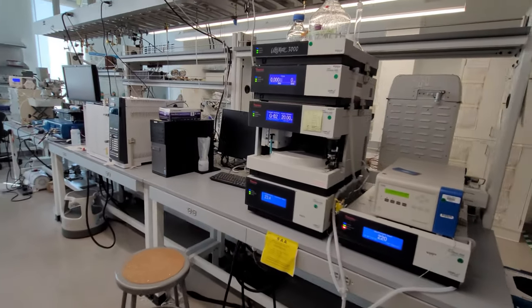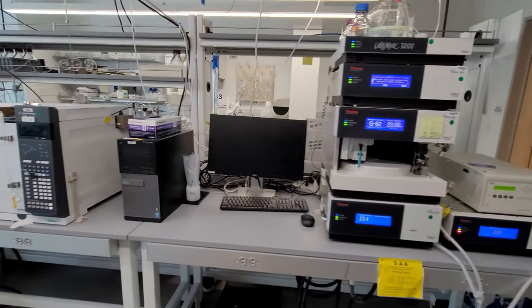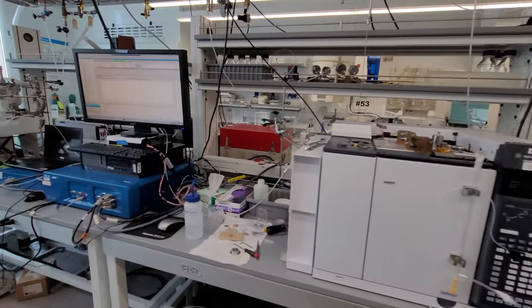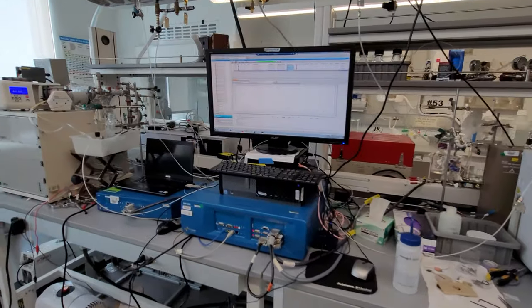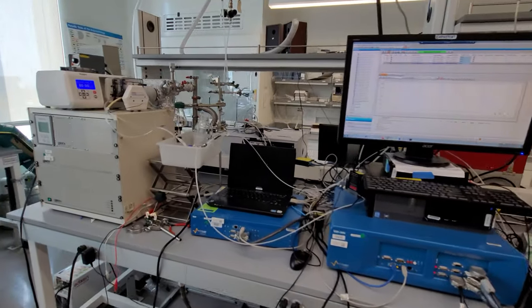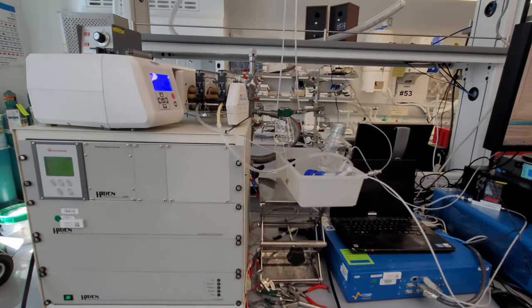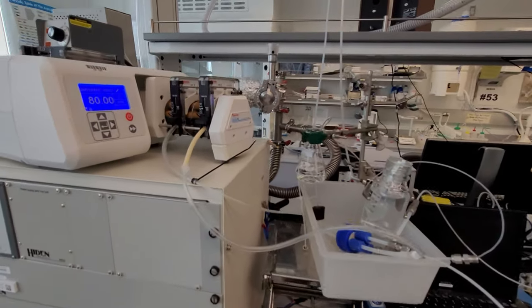While these measurements typically require multiple minute-long operation of the electrode to accumulate sufficiently high CO2 reduction product concentrations for detection, differential electrochemical mass spectrometry as shown here allows for real-time observation of products by pulling them directly out of the water into a high vacuum analysis chamber through a hydrophobic membrane.